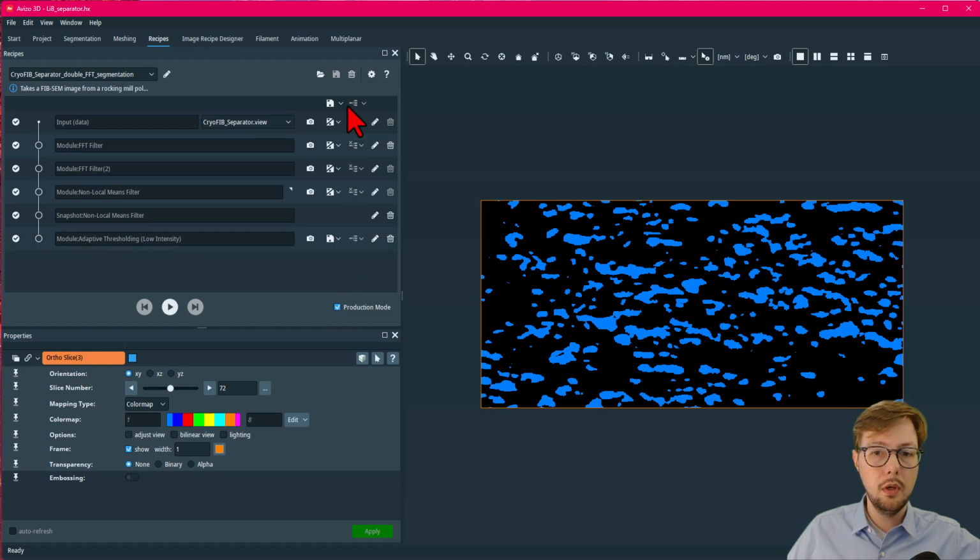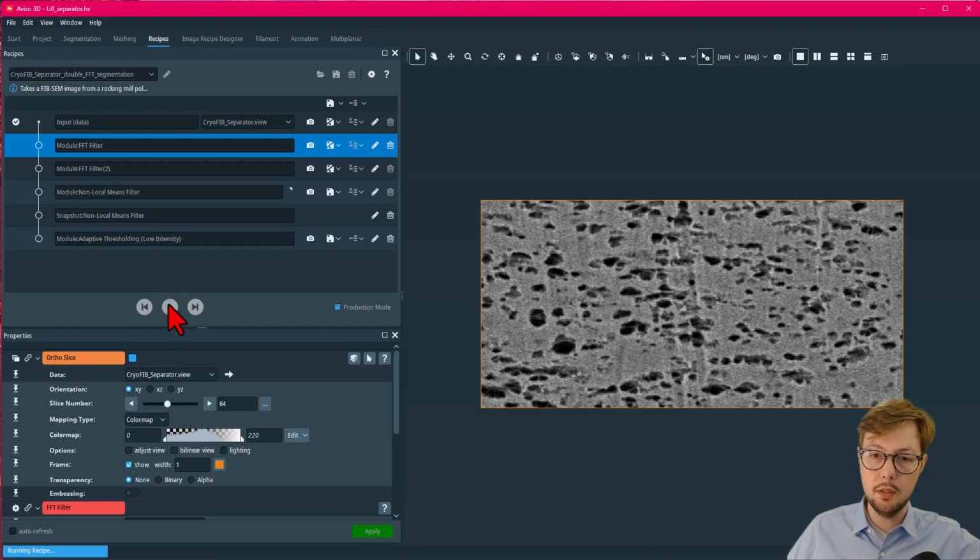In this mode, a column is enabled allowing you to choose to save intermediate results to disk. That can be useful if you want the output of a time-consuming step without having to reprocess the data.